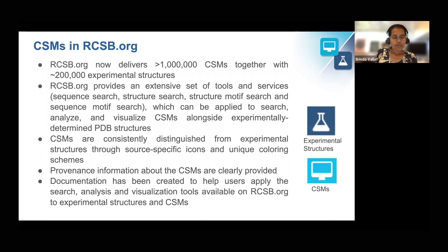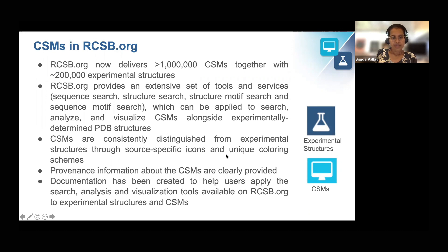This summer, we released an updated rcsb.org web portal which now delivers over a million computer structure models together with approximately 200,000 experimental structures. Rcsb.org provides an extensive set of tools and services which can be applied to search, analyze, and visualize computer structure models alongside experimental structures. These models are consistently distinguished from experimental structures through source-specific icons and unique coloring schemes as shown here. Provenance information about these models is clearly provided on the website, and documentation has been created to help users apply the available tools to study experimental structures and computer structure models.